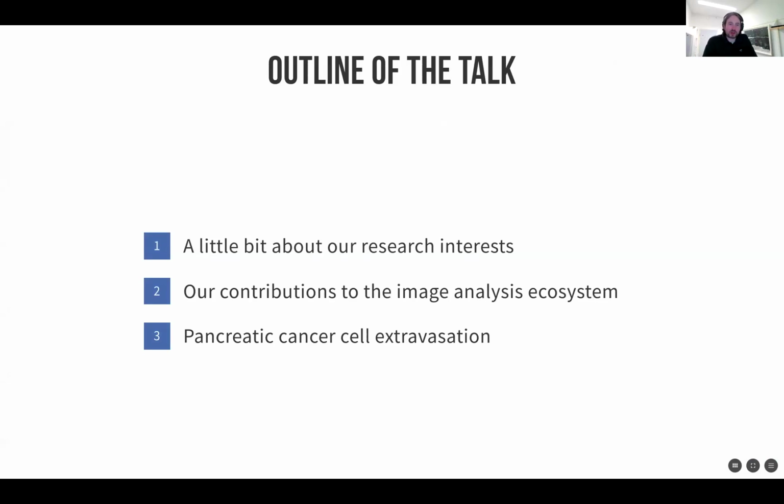Of course, I won't be able to tell you everything we're doing, and I won't try, but I want just to give you a little bit of an overview of some of the topics we are very interested in, in case you want to be in touch. We try to be very open and collaborative about what we do.